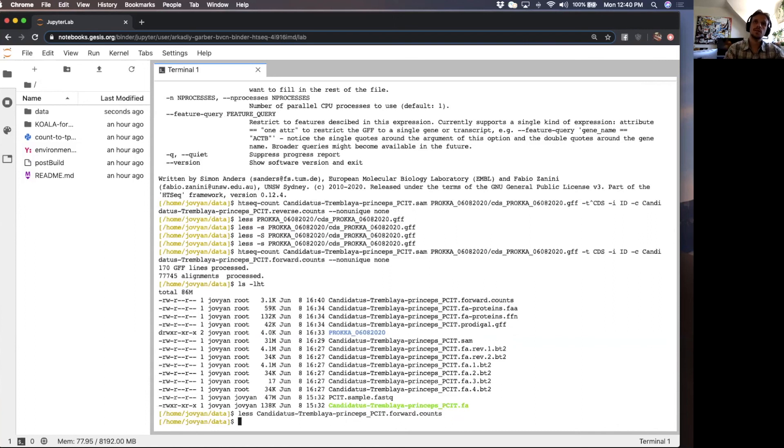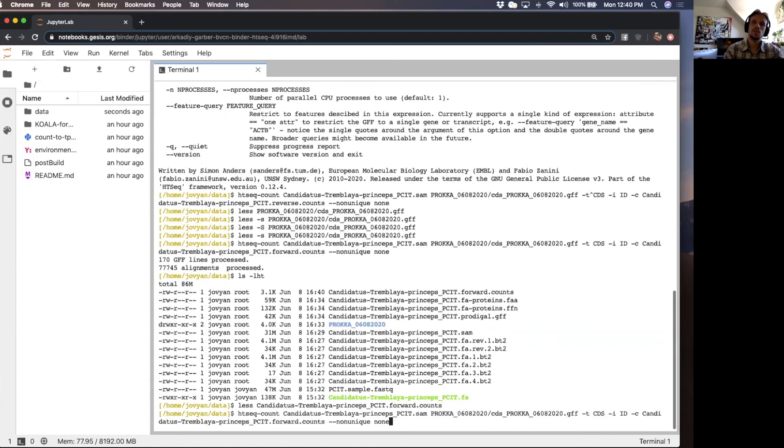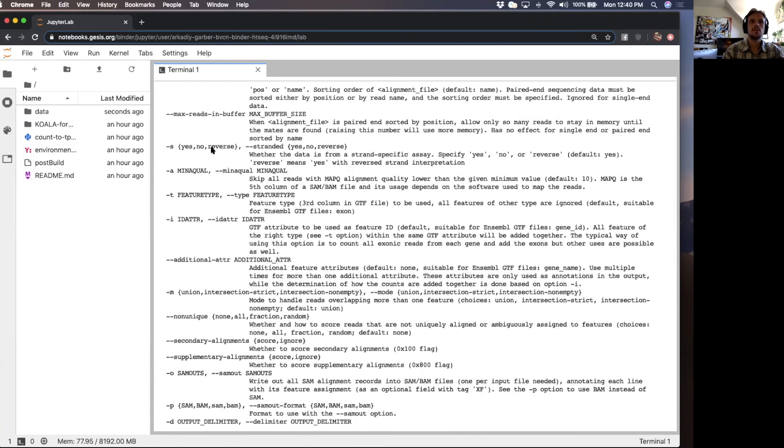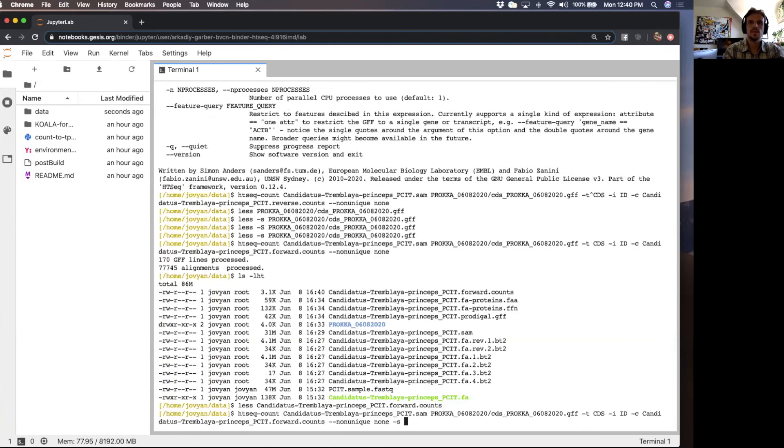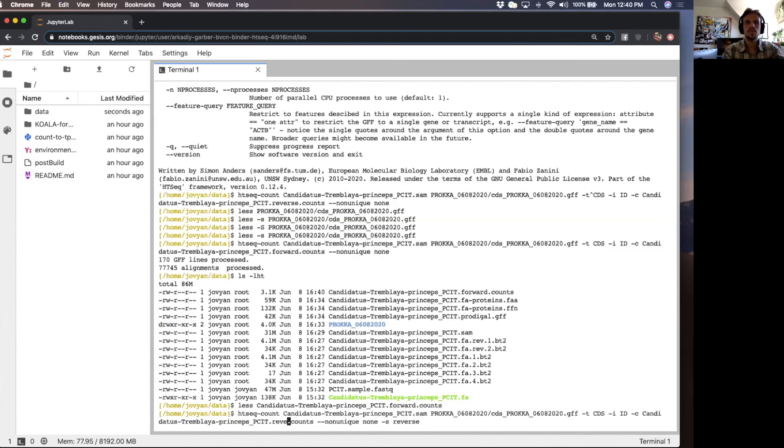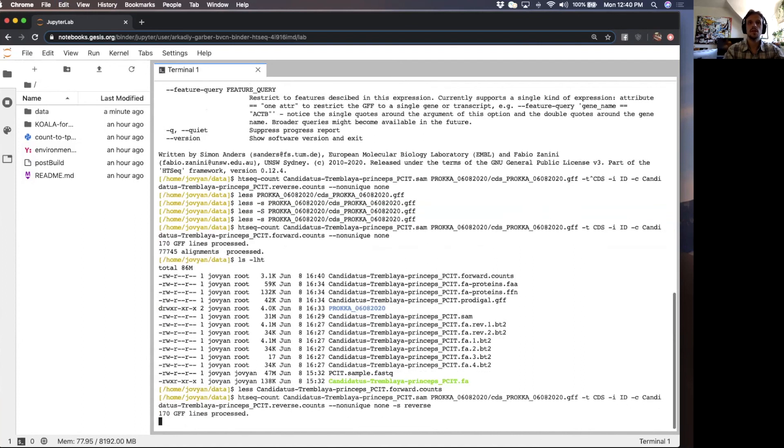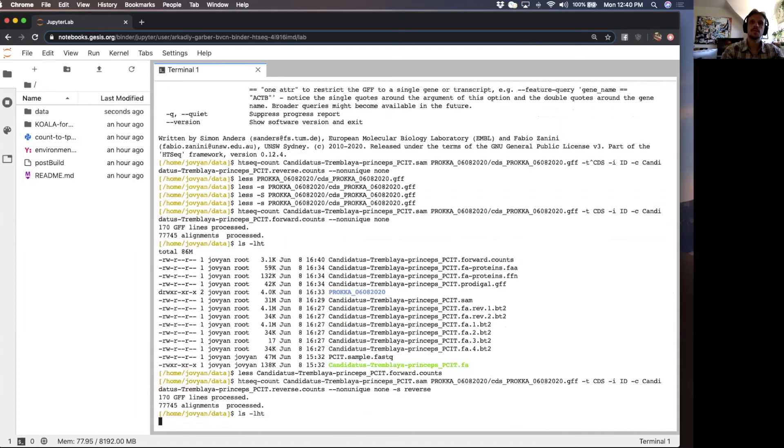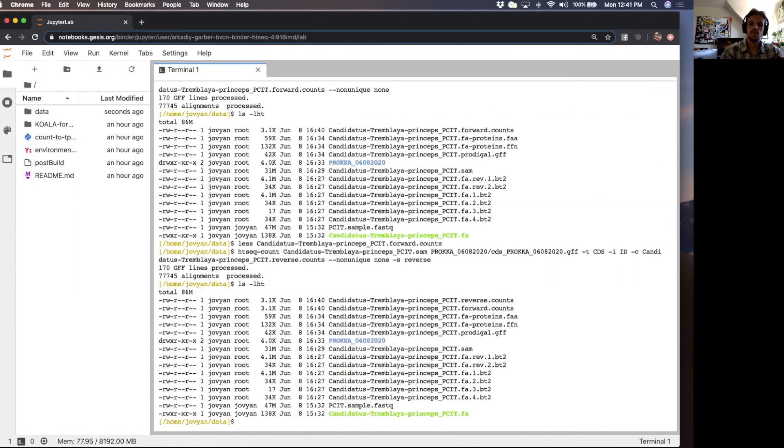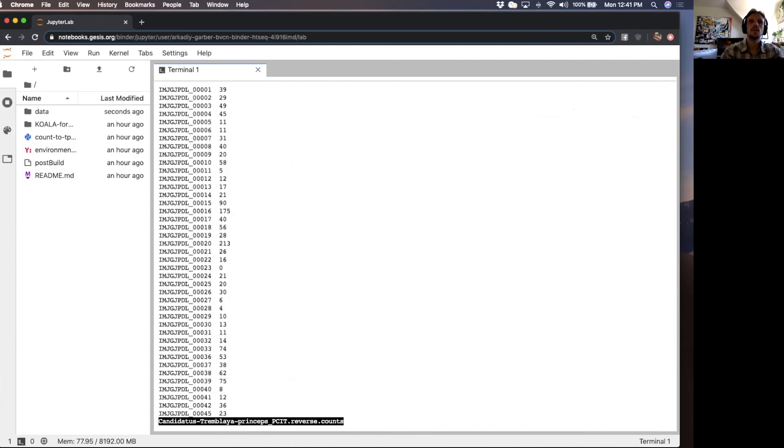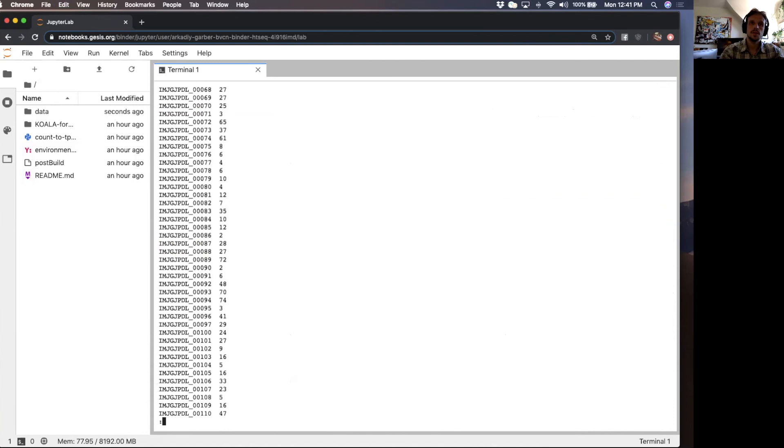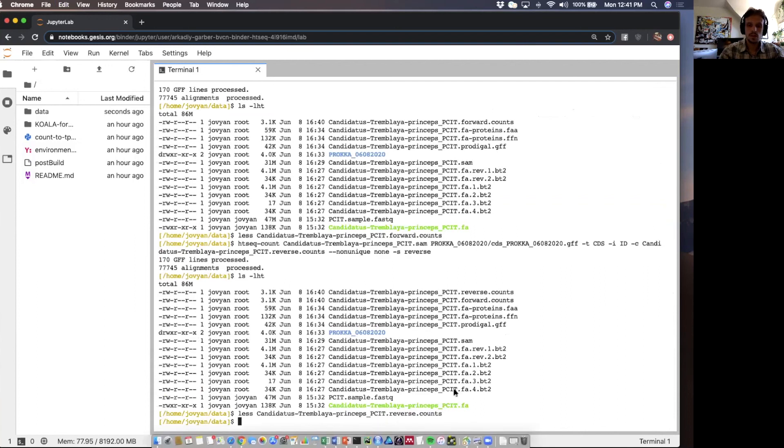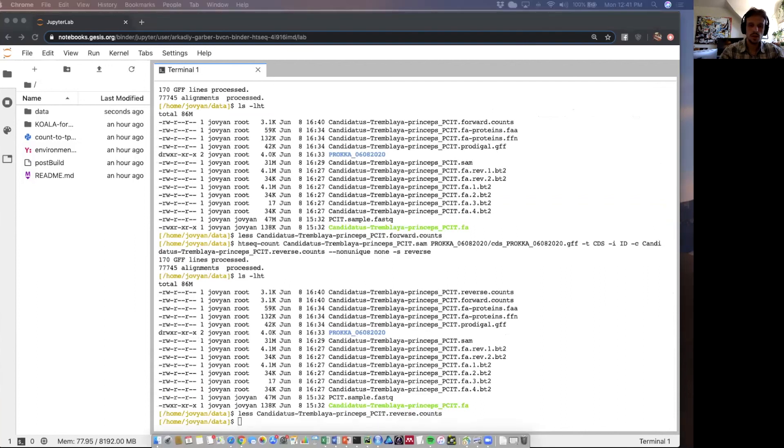But let's see if we want to rerun and we're going to add the dash s reverse flag. So we just want to count the reverse mapping reads. We're going to run this. Finished. So these are all the reverse mapping reads. I think that's actually it for this tutorial.